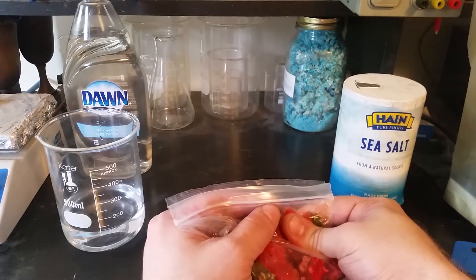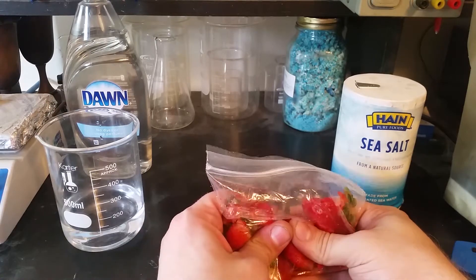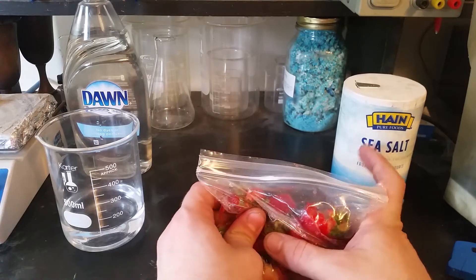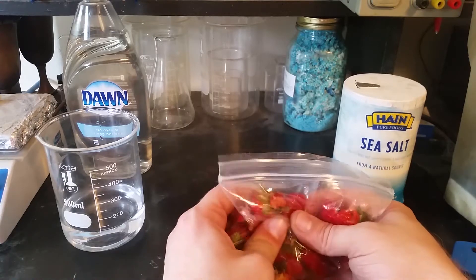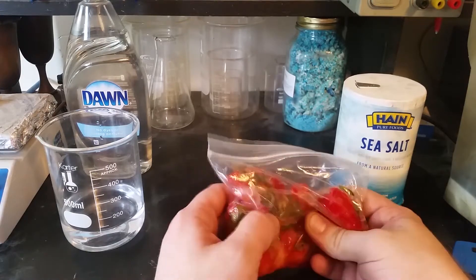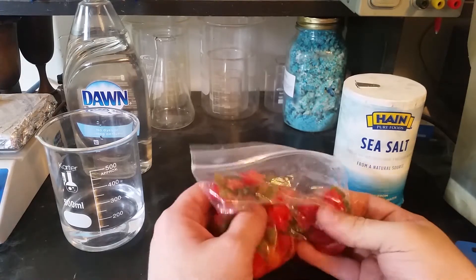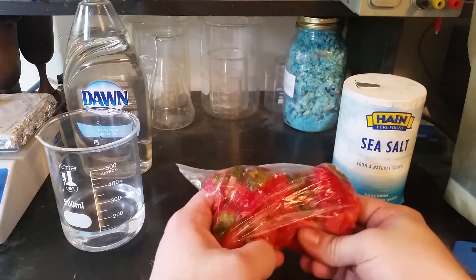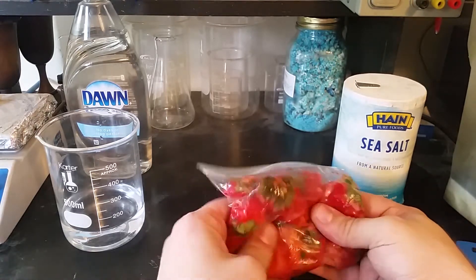He recommended using non-iodized salt, and all I have at the moment is sea salt, which is not iodized, but it's sea salt. It's got some other stuff in there besides sodium chloride. So I'm hoping that that does not mess things up too much. I guess we'll find out if it does, but I'm hoping that it doesn't.